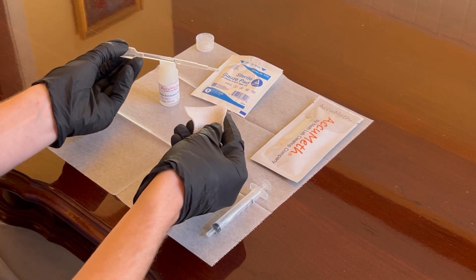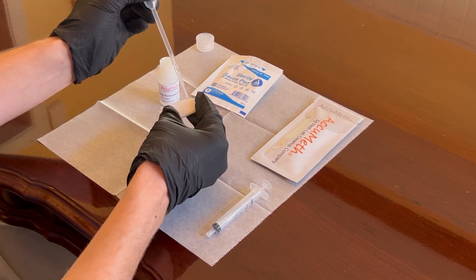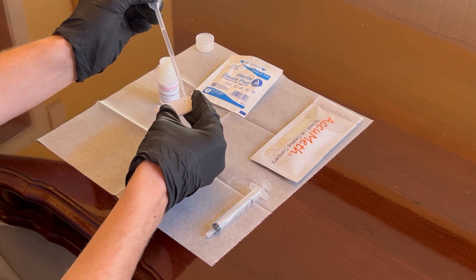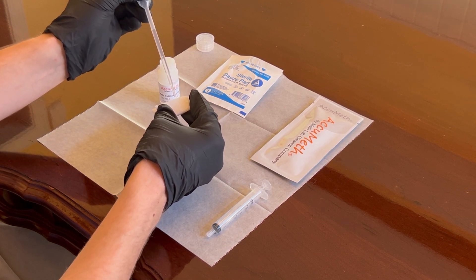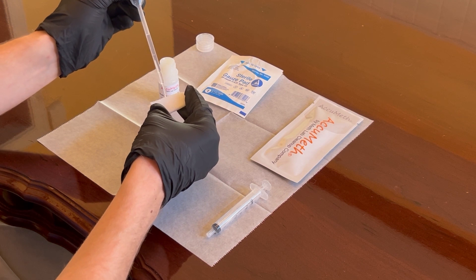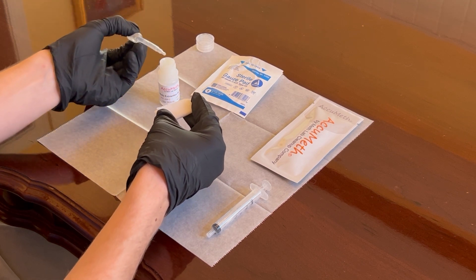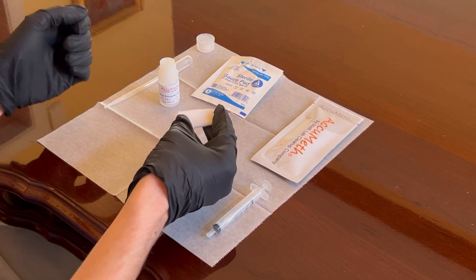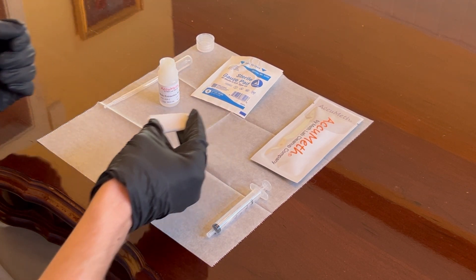In your other hand, fold the gauze wipe in half and carefully add 10 drops of buffer to it, moistening it evenly throughout. Now, with your folded, moistened gauze wipe in hand, go to your posted sample template to take the sample.